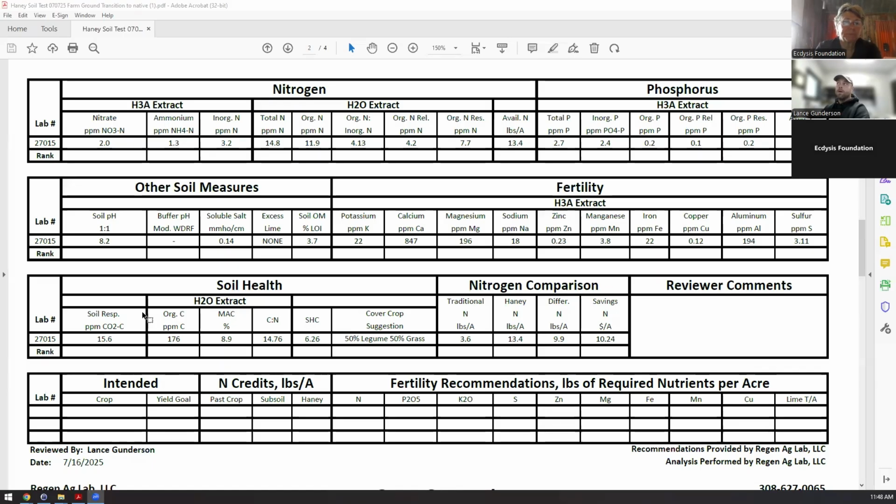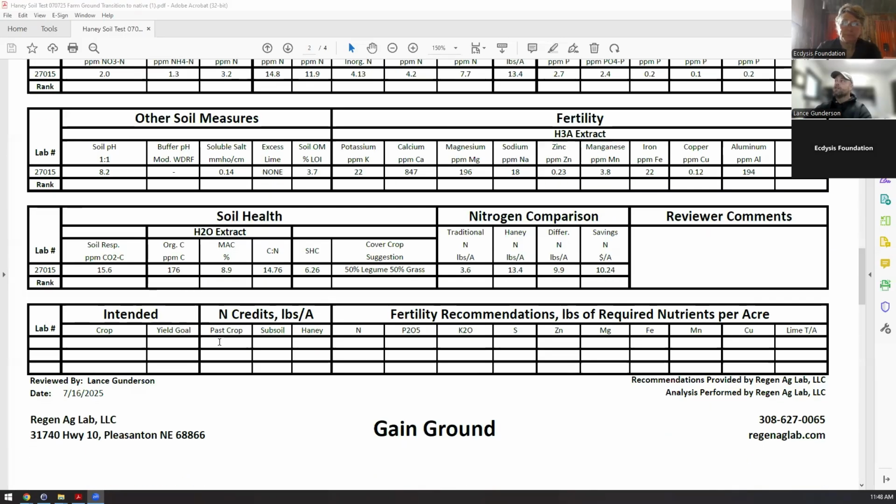most likely. Now, I understand how the samples are pulled and they're down transects, and there's 4 transects per field. So this is not necessarily indicative of the entire field. This is a spot in the field, right? And if we keep going down, well, here's the very next one.